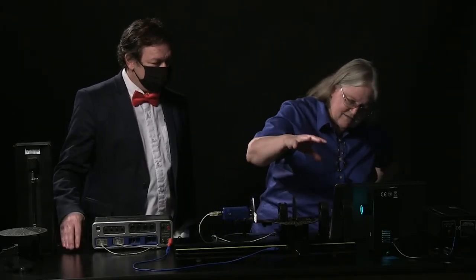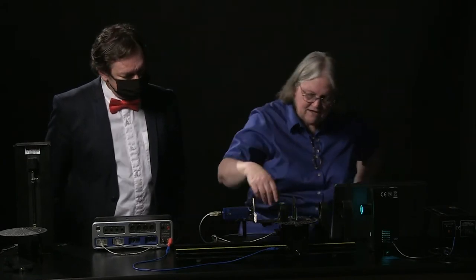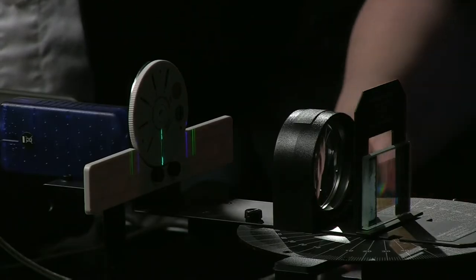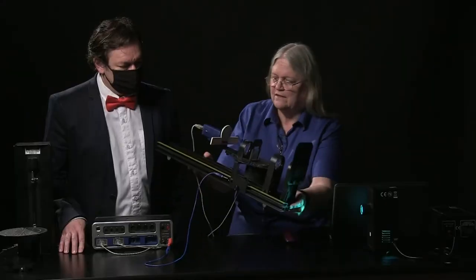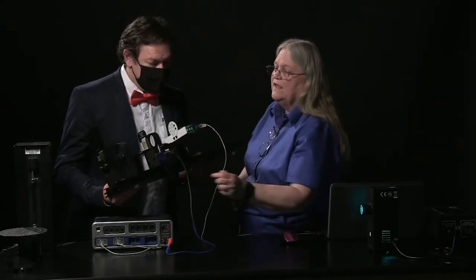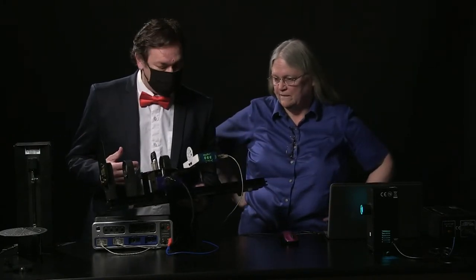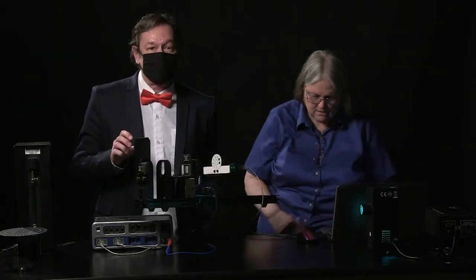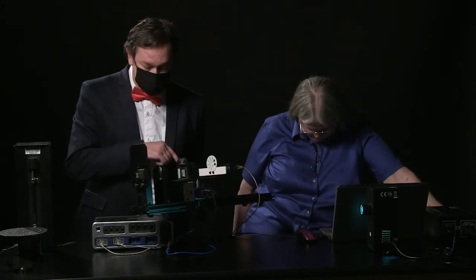The way this educational spectrophotometer works is it uses a high sensitivity light sensor and a rotary motion sensor. If you're familiar with PASCO products, we have wireless sensors, blue sensors called Passport, and sensors in black cases called Science Workshop. The Science Workshop sensors are analog, and the benefit is that if you want to adjust the gain, you can do that on the sensor and in the software.